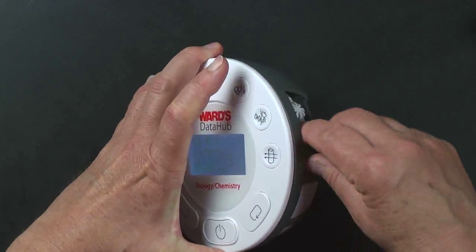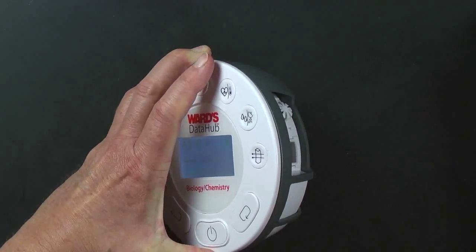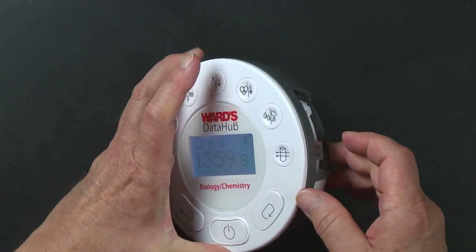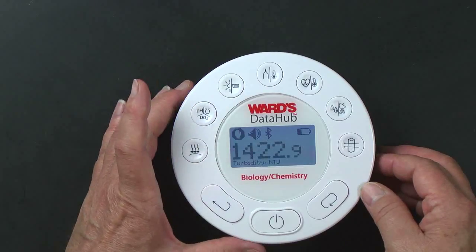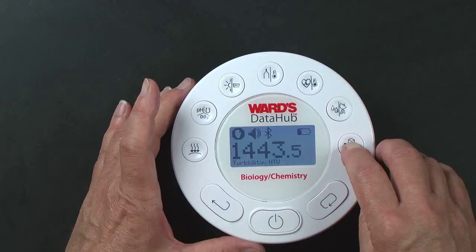So each one of these, if I compare this one, about 270, with the brown one, which has the enzyme substrate, you can see that it's almost 1450, which makes sense because the transmittance, this is not transmitting as much because it's darker.